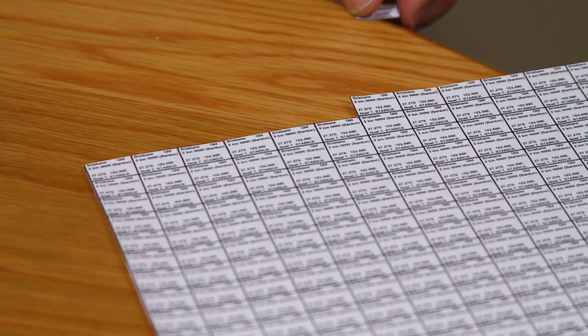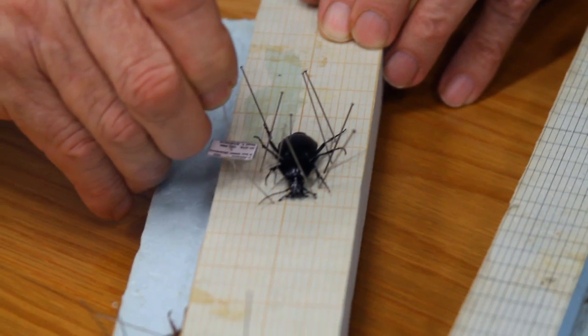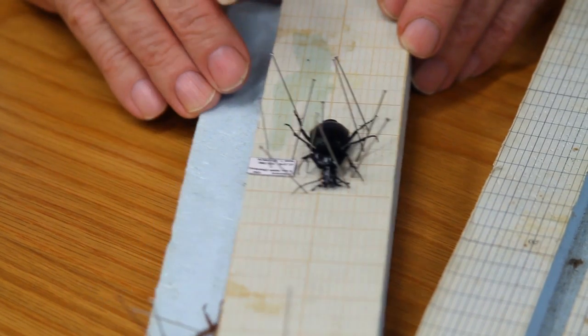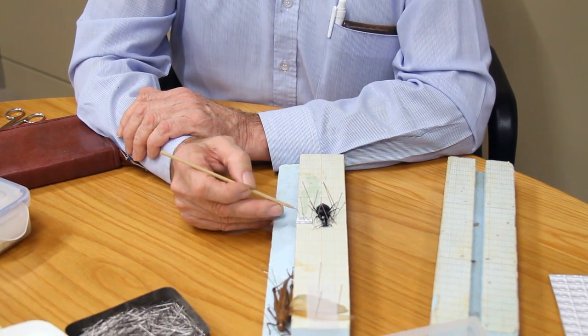The next step is to put a label on each of these pinned insects. We place a pin through the centre of the label and put it beside the insect — it stays with the insect until it's dry. We need to put the location — the city, in this case Brisbane, Queensland — and roughly where it is, in this case six kilometres northwest of Brisbane. Then we put the date, and it's important to put the full year, because insects can be dated back to 1811, 1911, and 2011. We also put the longitude and latitude and the name of the collector.